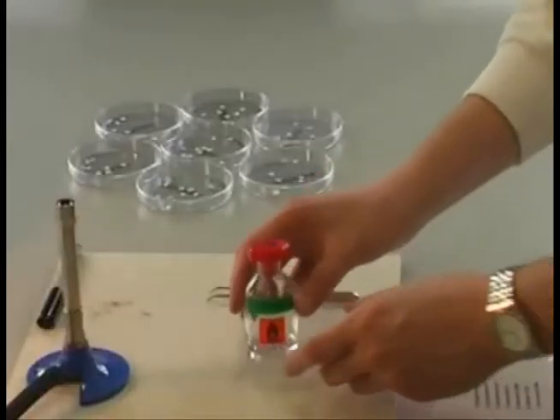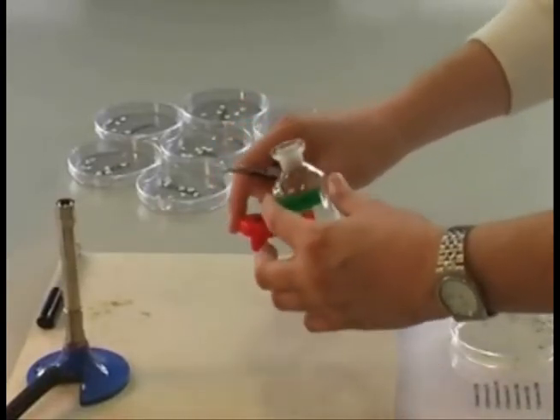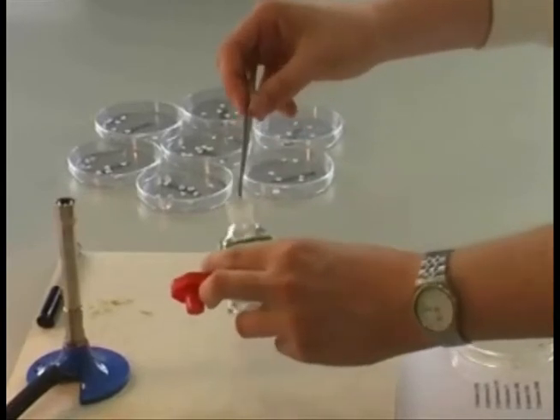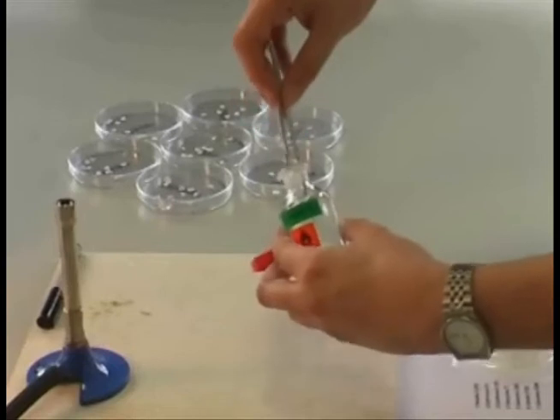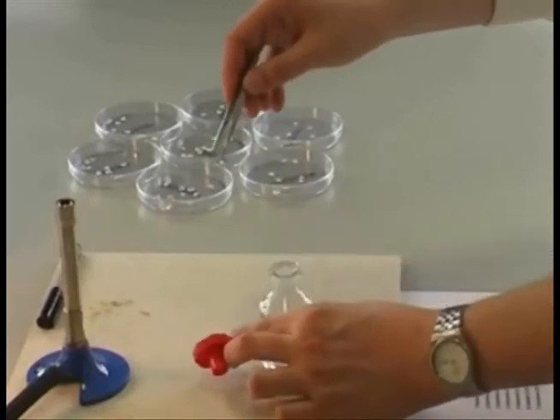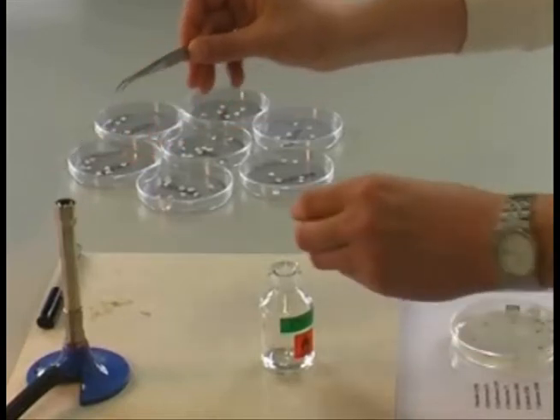Before starting and between placing each antibiotic disc, it is important to sterilise the tweezers by dipping the ends in ethanol. Once done, carefully remove the dipped tweezers from the bottle, keeping them angled downwards. Place them in the Bunsen flame to sterilise. Replace the lid on the ethanol bottle.